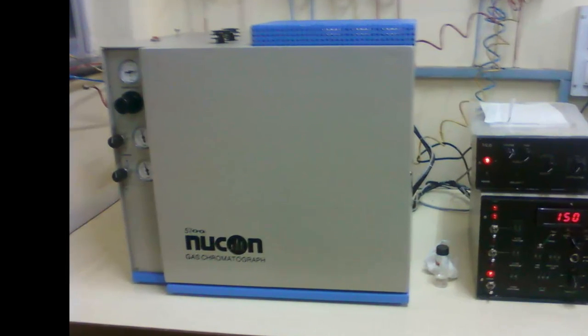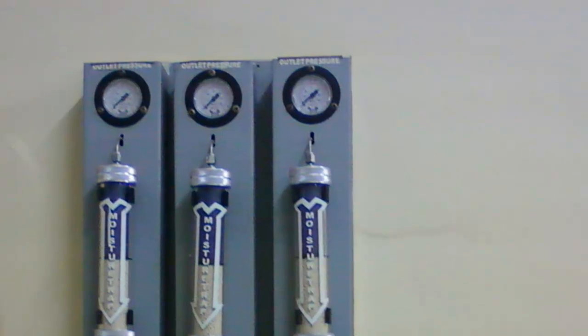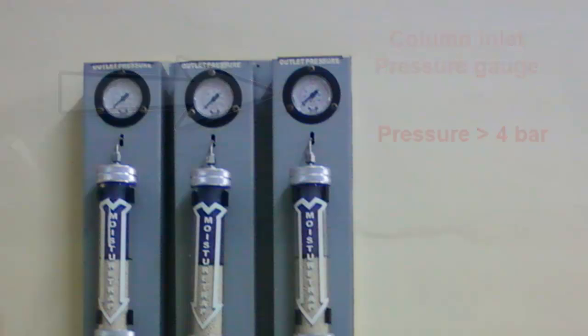Procedure. Check if there is sufficient pressure maintained at the inlet of TCD element. The pressure has to be greater than 20 psi. Similarly, ensure that the pressure of the gas at the inlet of the column is greater than 4 bar.